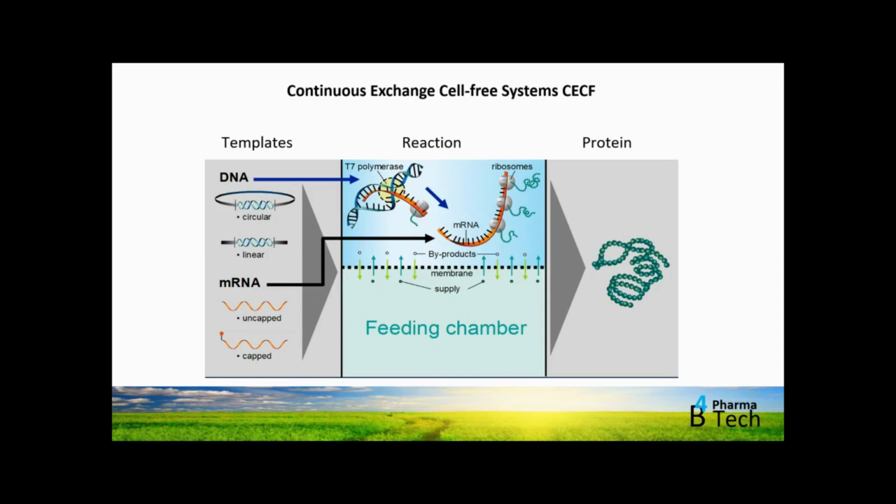So now we can spike in the DNA, a circular plasmid DNA, as long as it harbors a T7 promoter. It might also be another promoter if we add another polymerase. The linear PCR product goes into the so-called coupled system. Transcription by T7 RNA polymerase leads to RNA. RNA is then simultaneously translated into the protein of interest. Unfortunately, the protein of interest doesn't jump out of the reaction. This we have to optimize, but the protein of interest can be easily purified directly from the reaction.